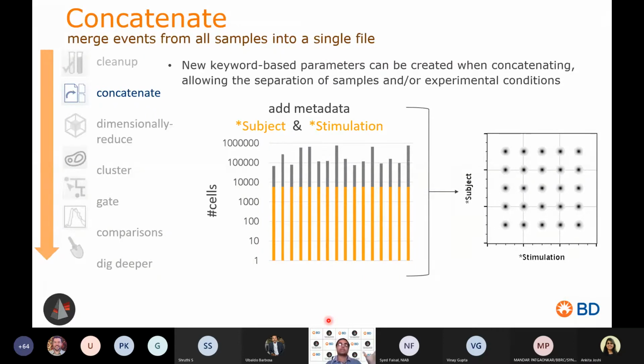So you have to merge everything together, make a single file, and then do the clustering or whatever analysis on that. After you do the analysis, you can gate apart different conditions and see how things change across your different experimental conditions. Because these are non-deterministic, you cannot do it on individual files. You have to pool everything together in a single file and then do it.